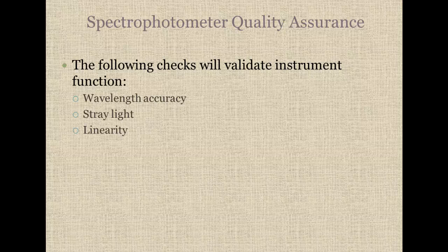With the spectrophotometer, we do have to do quality assurance as well. We need to check the wavelength accuracy, any stray light, and the linearity, which again is how low can you go to how high can you go.